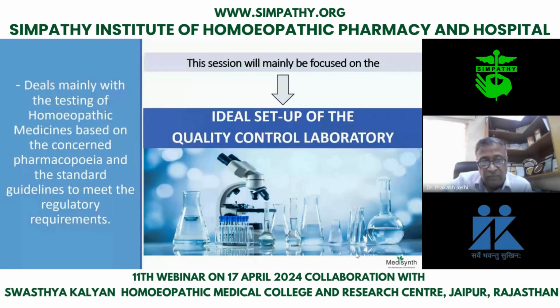In pharmacy, if you want to open an industry or industrial pharmacy, then you should first have a quality control laboratory where you test the raw material, because it is very simple: you cannot make a good product from a poor raw material. So how to select the raw material? I will give you one example. I do not have a slide here right now, but I want to tell you some extra things.